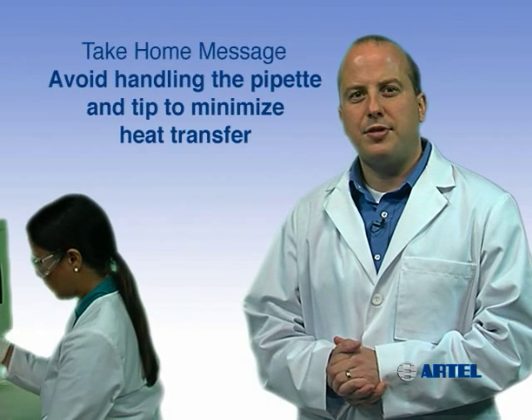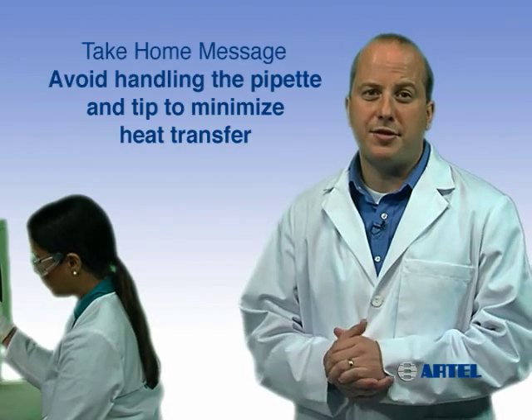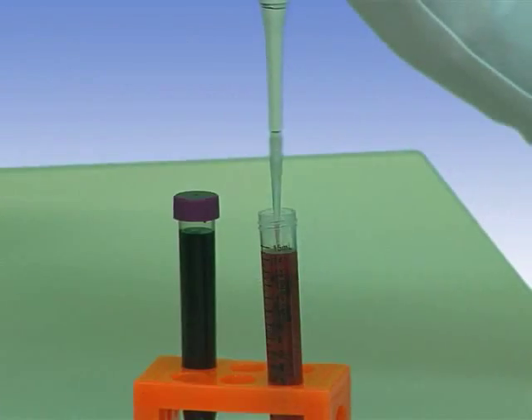The take-home message is: minimizing heat transfer, such as by not over-handling the pipet and the tips, will help reduce errors in volume transfers.